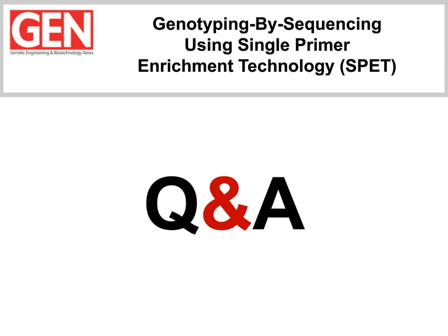Well, when sequencers provide longer reads, they will also likely make this system able to give a more detailed reconstruction of haplotypes by simply exploring more bases. And it's always a trade-off between the read length and the sampling number. So it really depends on the final outcome that the researcher wants.